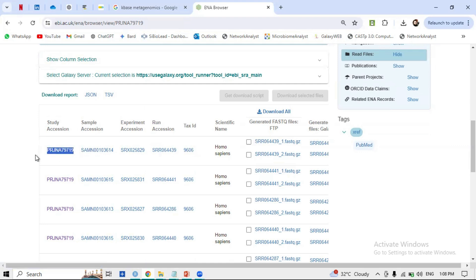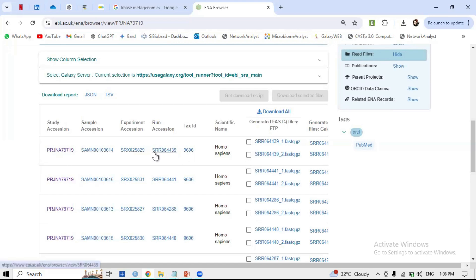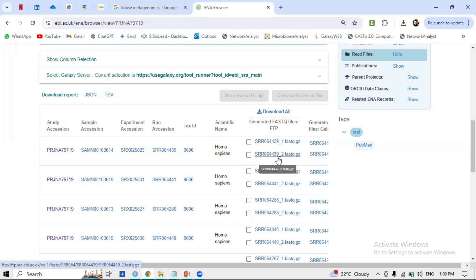Here is a sample with its study accession number, sample accession, and experiment accession. The SRR ID is the identifier of a sample when it is processed inside the sequencing machine. For example, SRR064439 is paired-end, so it will consist of two files: underscore_1 (forward) and underscore_2 (reverse). These are paired-end reads.